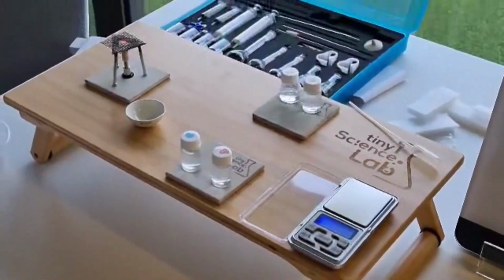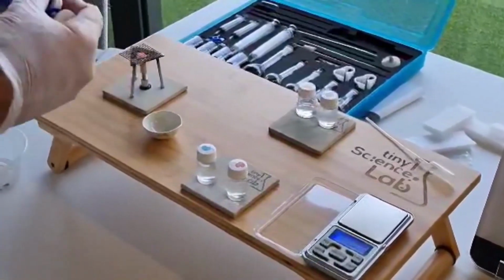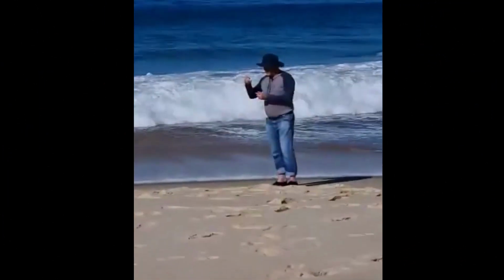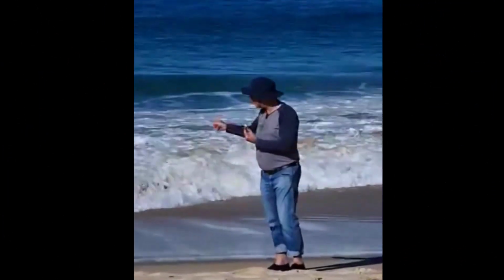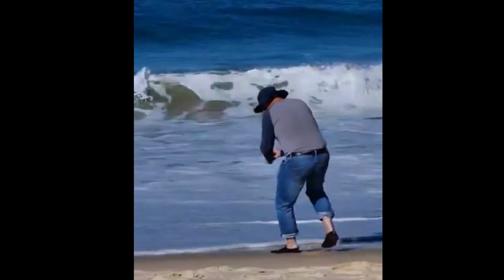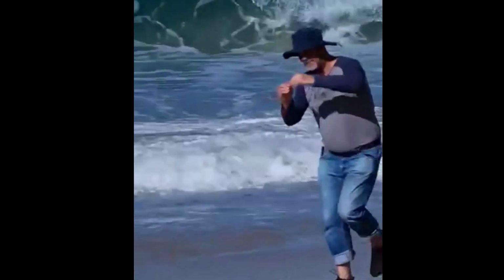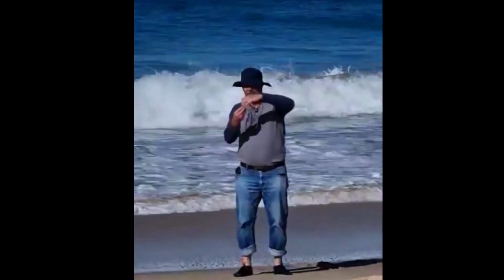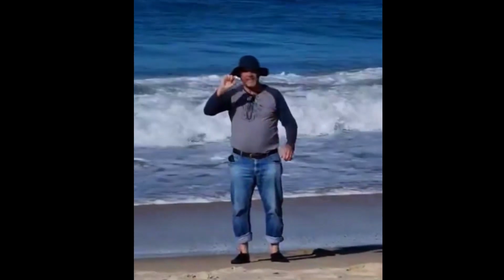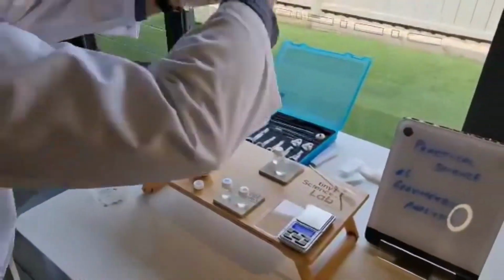So our first sample is going to come from Zenith Beach. Zenith is the green. Okay, so what we're going to do first of all is take a little sample of beach water from Zenith Beach. So there's our Zenith sample.